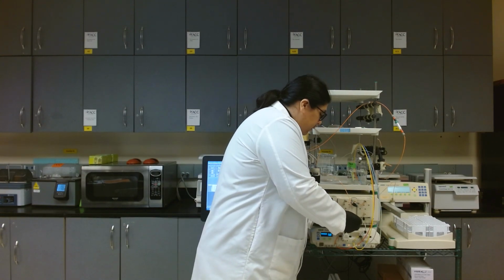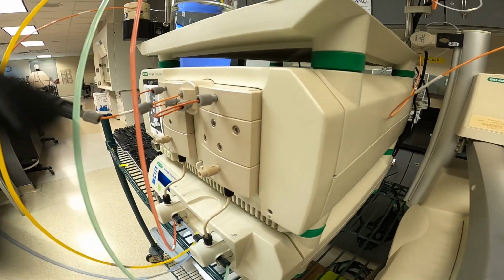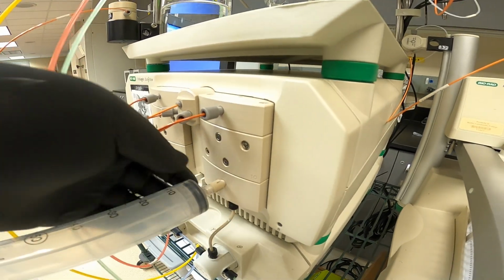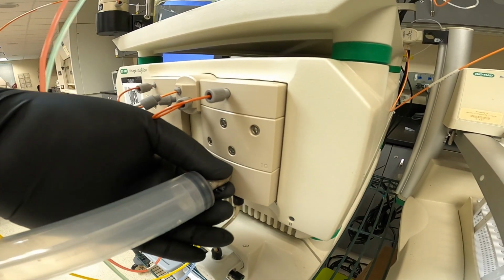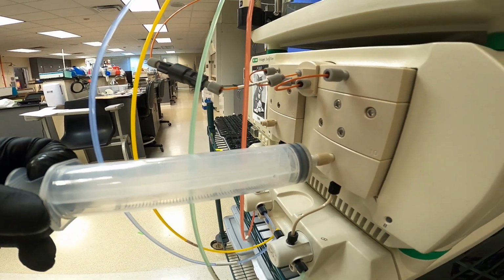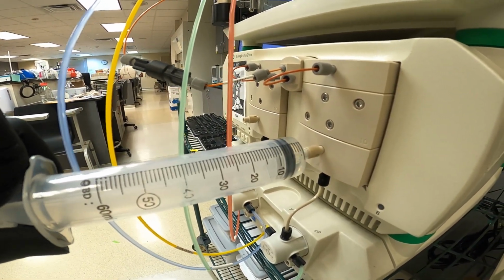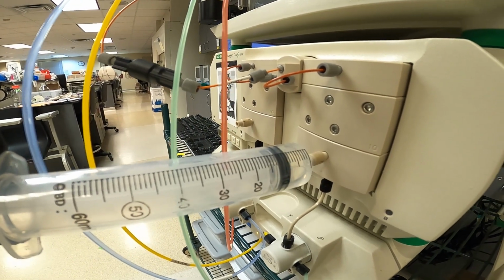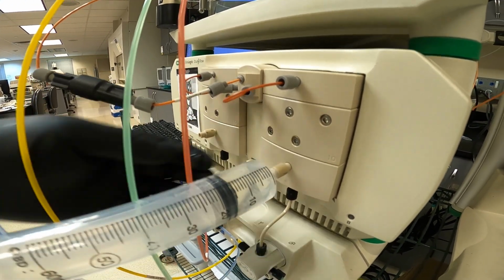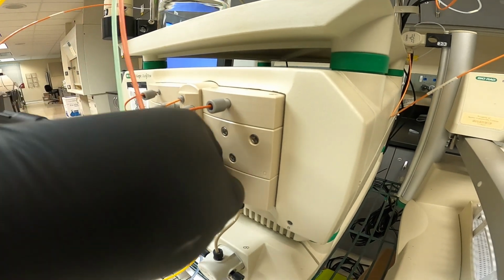I'll repeat the process, and then I'll repeat that on side B, and the other side. I'll place the syringe on there. Should be pretty snug. Then twist at the port here. Turn, and then I'm just going to withdraw 10 to 20 milliliters. There shouldn't be any air coming out. Should not. So we'll stop that. Close the port. And then remove the syringe.